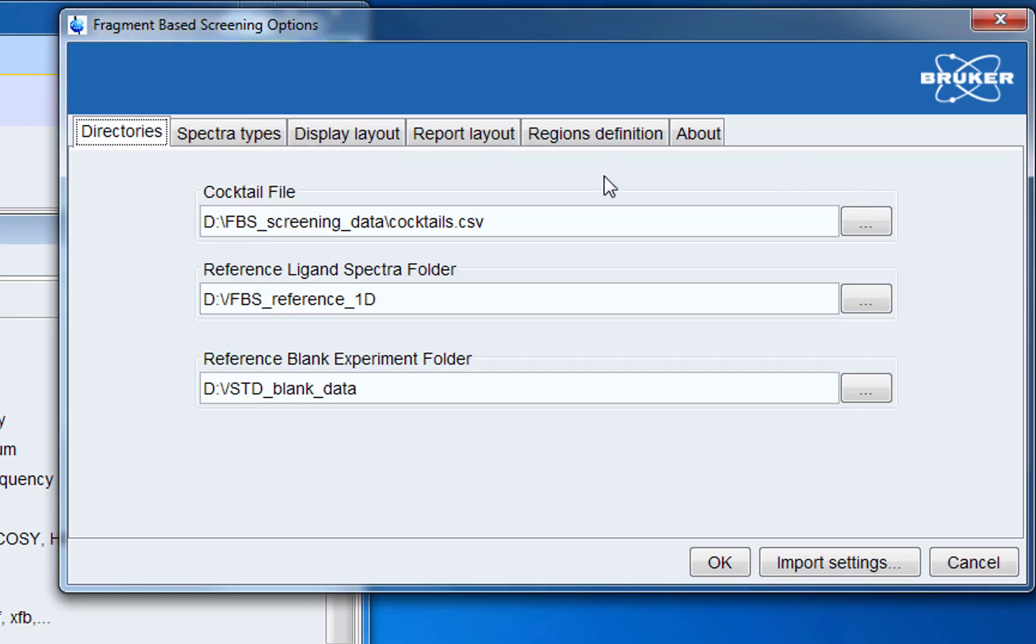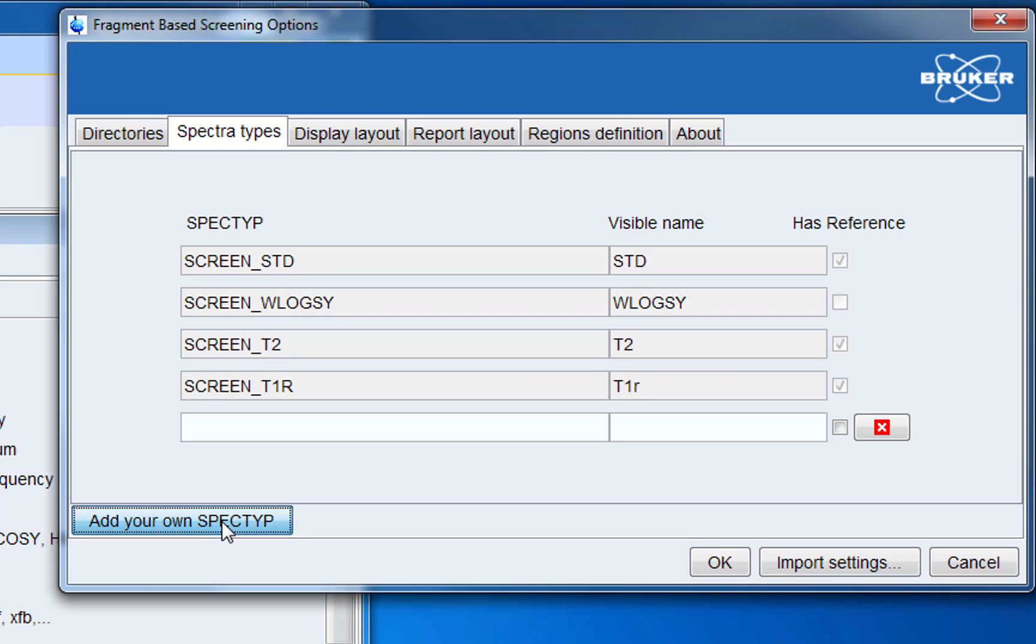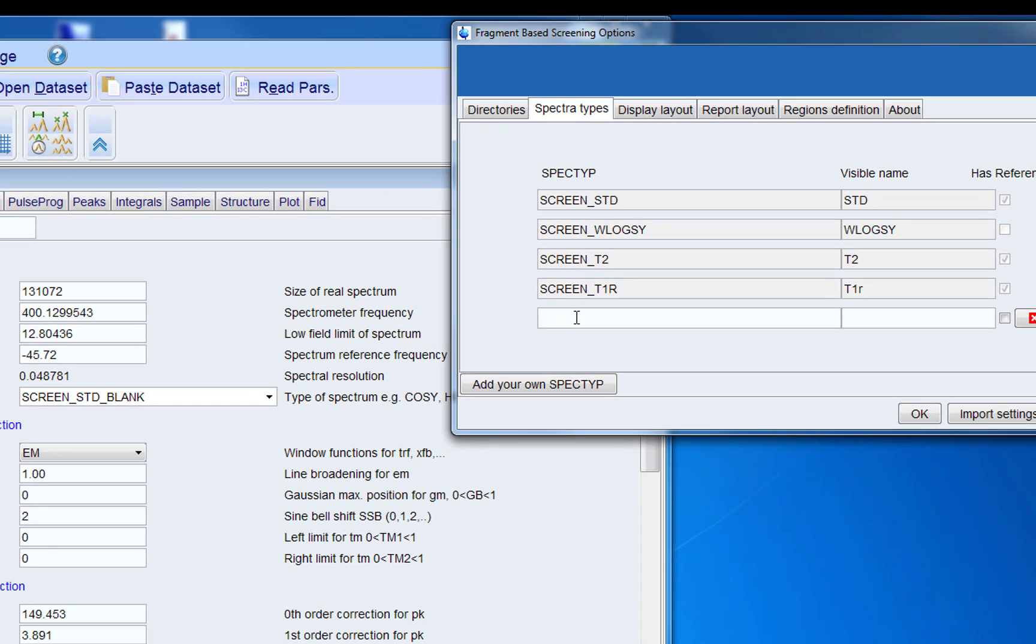Now we go back to the project table and go to spec types. Now we can add our own spec type. In the left side we add exactly the same spec type as we have used when we acquired the data. So this would be screen std underscore blank. And on the right hand side we can choose a visible name of our choice.